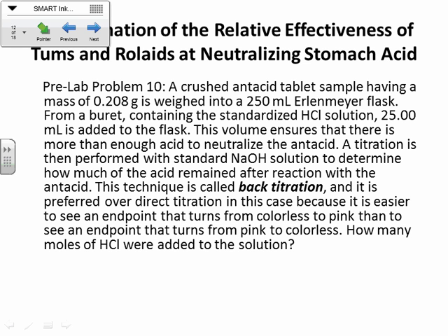I'll figure out something so that you guys don't have to keep rinsing out your burets because you're adding HCl and then you have to add NaOH and you have to add HCl. That's going to take too much time. So I want you to just keep NaOH in your buret, and then we'll figure out something else to measure out that HCl solution. Okay? So you're adding that 25.00 milliliters of HCl.